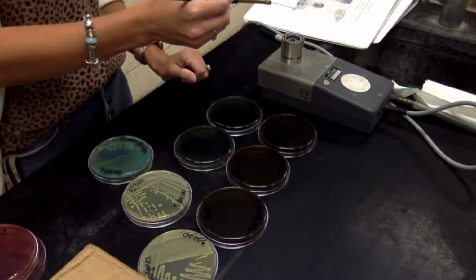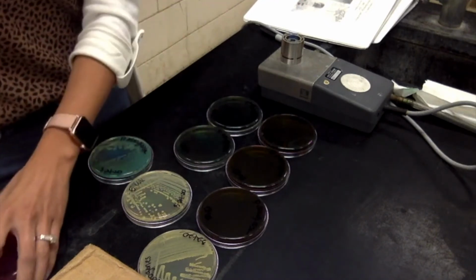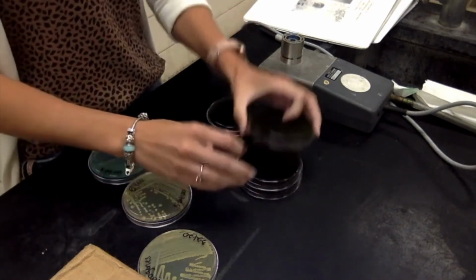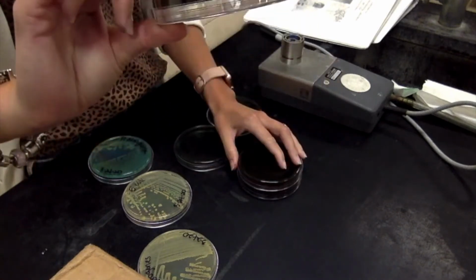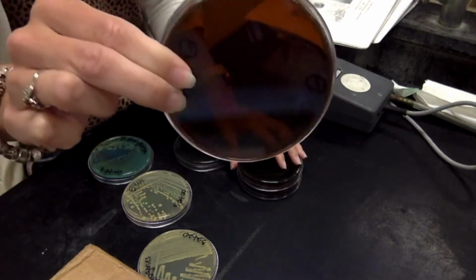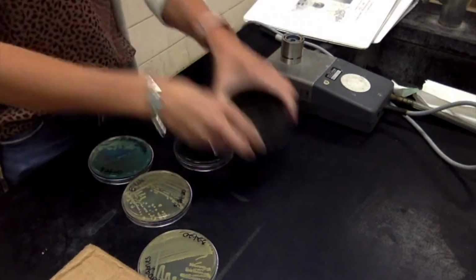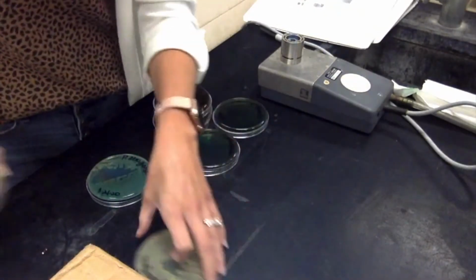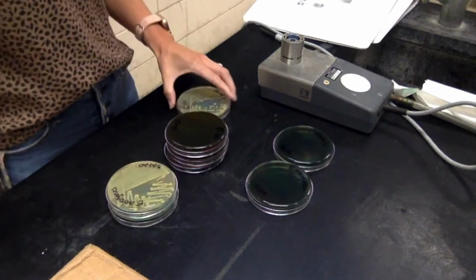Okay, the MacConkey plates are done. Add those to my box. Now I'm going to do the EMB plates. So here's what the EMB looks like. It's kind of like a purpley, weird looking color. So for these, I'm going to be using E. coli, Enterobacter, and Pseudomonas. First, I'm going to do the E. coli.